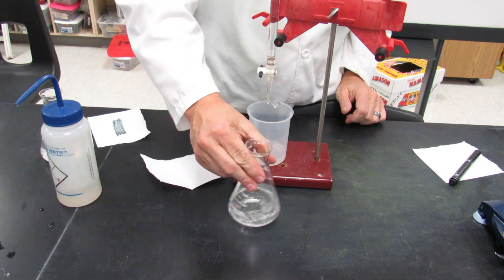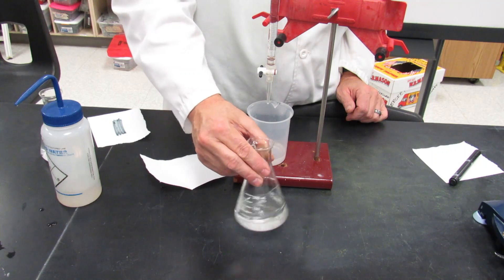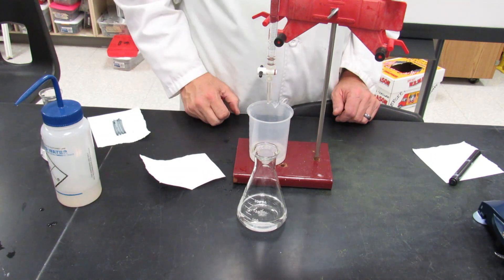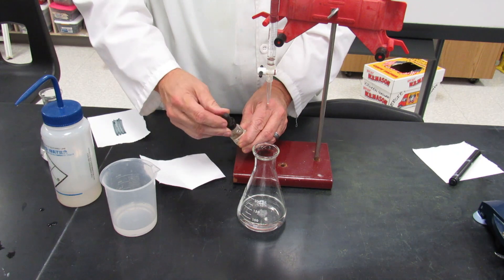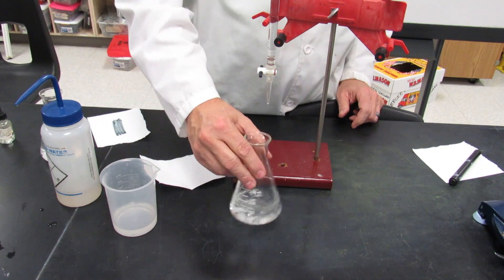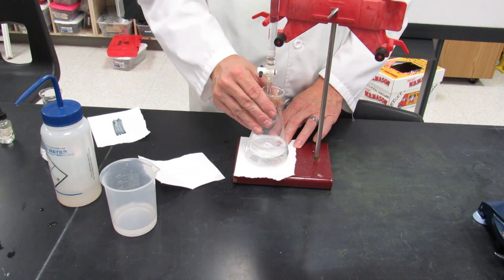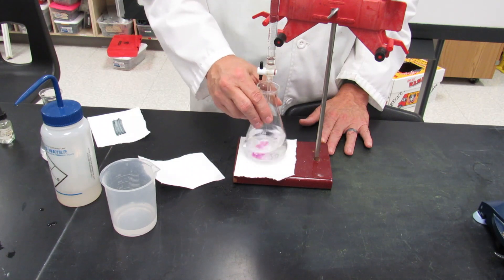Swirl the flask to dissolve the KHP. Not all of it will dissolve right away, but that's okay — as you titrate, it will gradually react with the sodium hydroxide, so just make sure it's fully dissolved by the end of the titration. Next, add phenolphthalein indicator; it may turn a little cloudy since it's alcohol-based, but it will clear up. Your burette should already have sodium hydroxide in it. Place a white piece of paper underneath and swirl the flask as you gradually dispense the sodium hydroxide.